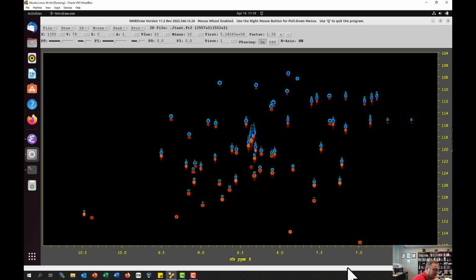So this stuff down here at the bottom, that actually is in phase. It's negative, but it's in phase. This stuff here at the top is also in phase, but it's positive, or mostly in phase. And then it sort of makes this transition between the two. And so clearly this is the wrong value for this spectrum, but it is the correct value for some spectra.